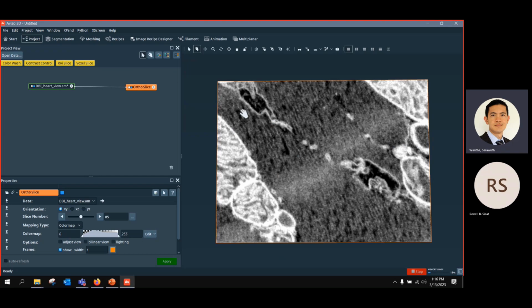So we're going to introduce a new machine learning tool, which we call texture classification. As the name suggests, it is texture-based classification. That means you define the texture of your image. It's not based on intensity anymore, but on the repetitive pattern of the image. You define the regions of the image that have similar or repetitive patterns, and then you run the machine learning.